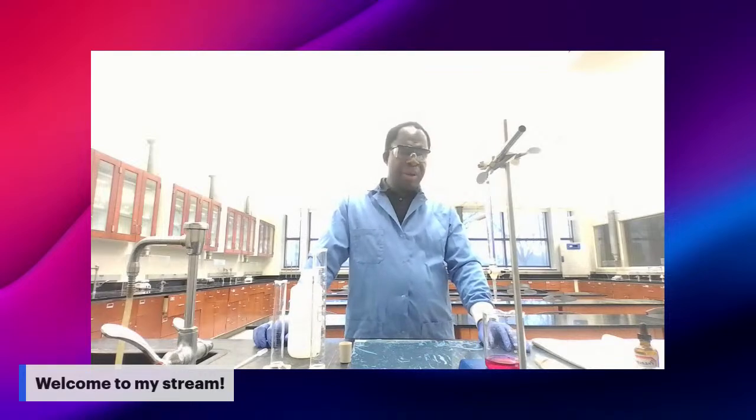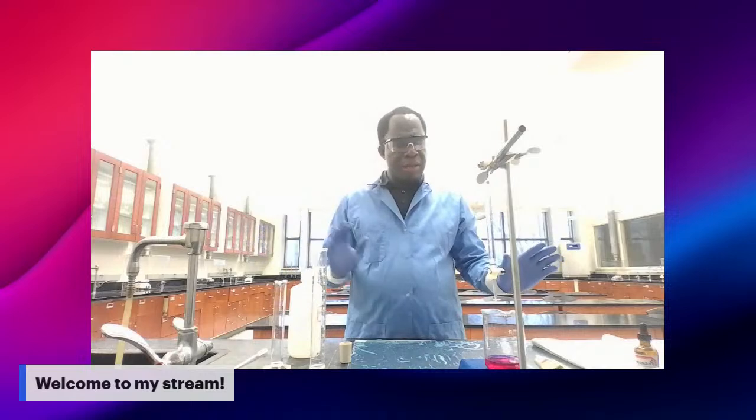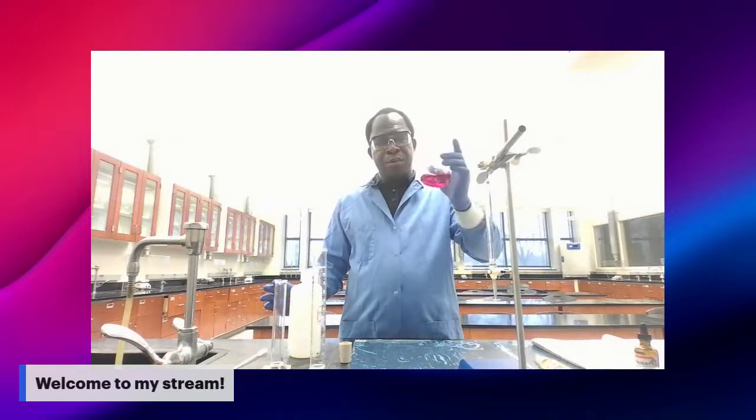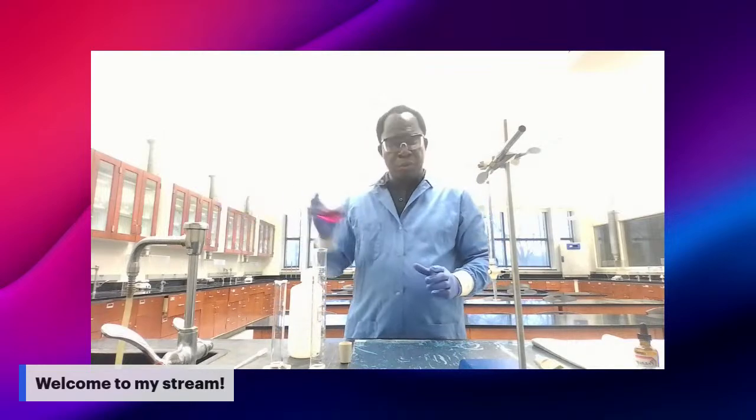When you're done, make sure you clean up. Clean up means you dump your solution into the liquid waste.